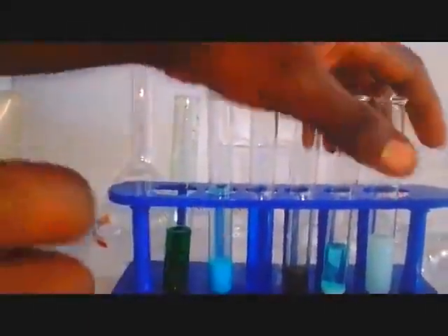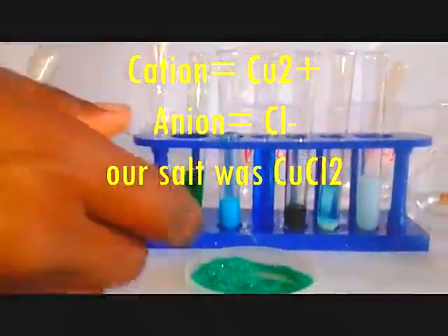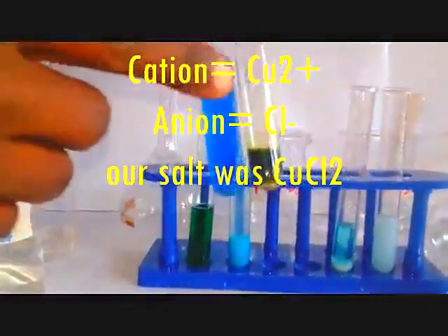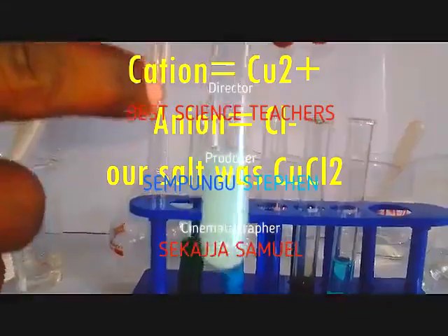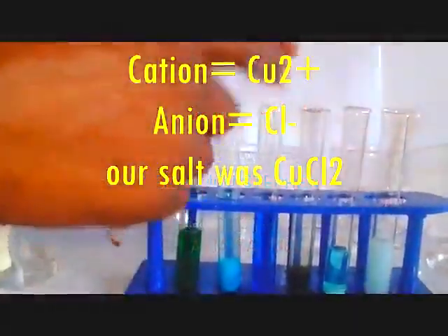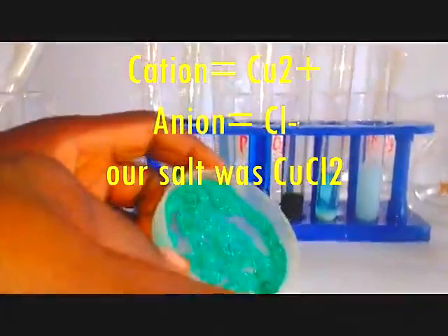Therefore, from this point of view, we can conclude we're using a salt of copper 2 chloride, because we got our cation as copper 2 ion. We confirmed it using aqueous ammonia and potassium iodide. And we got our anion as chloride ions. So it means we had a combination of copper 2 ions and the chloride ions. So our salt is copper 2 chloride.